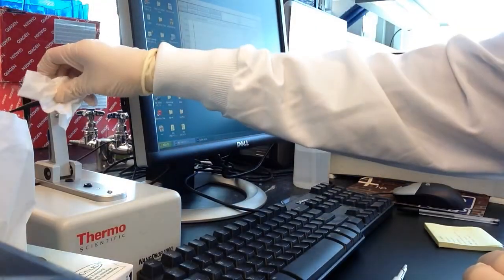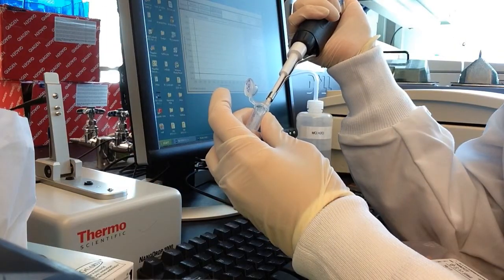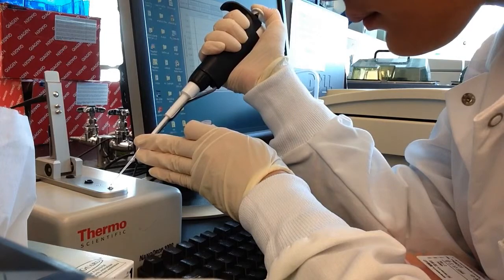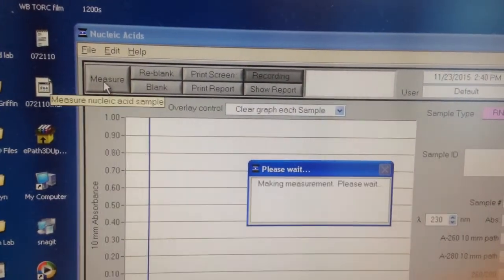Wipe the pedestals with Kimwipes again, and then load between 0.5 to 2 microliters of your sample, depending on how precious your samples are. And then go ahead and click measure.